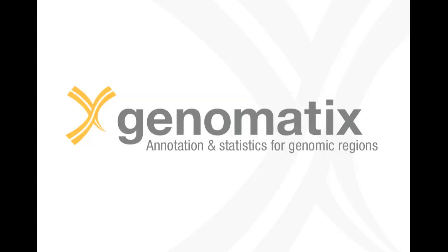This tutorial will show you how you can generate annotation for genomic regions and use this information to identify potential regulatory targets of transcription factors.